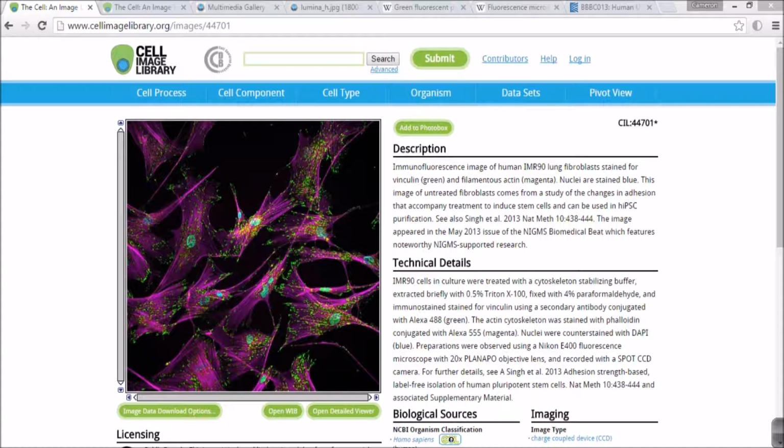Fluorescence microscopy is a very useful technology in cell biology. The special thing about fluorescence microscopy is that glowing labels emphasize the subject against the background, increasing the resolution of the image. For example, this image represents mammalian fibroblasts with multiple fluorescent labels.